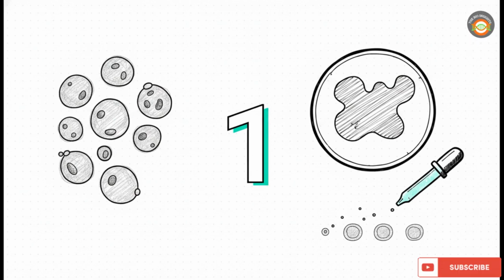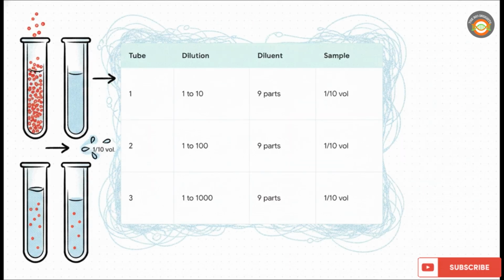If you were to just smear that 1 milliliter on a plate right now, it would just grow into a giant, unreadable blob. There are simply too many cells. You have to thin it out. And this brings us to the elegant math scientists use to solve that density problem. It's called a dilution series. Think of it like a cascading waterfall of math.